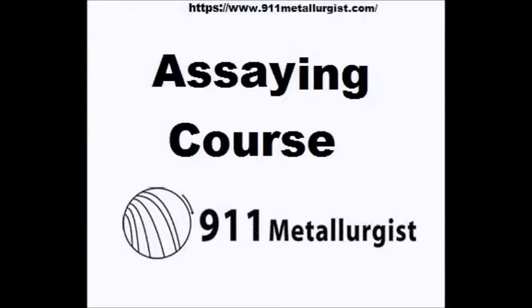The absolute loss is only 0.002 gram, but this equals 2% of the silver present. In the same way, the student should see that the two results, 91.5% and 92.0%, are really more concordant than the results 9.1% and 9.2%.